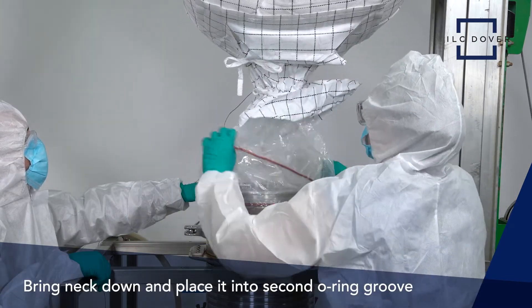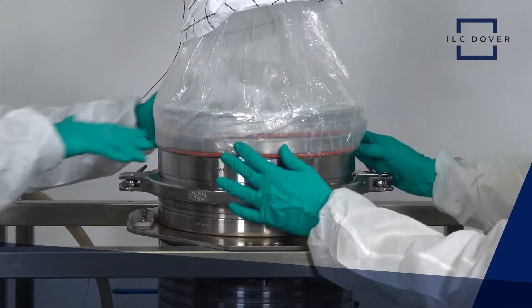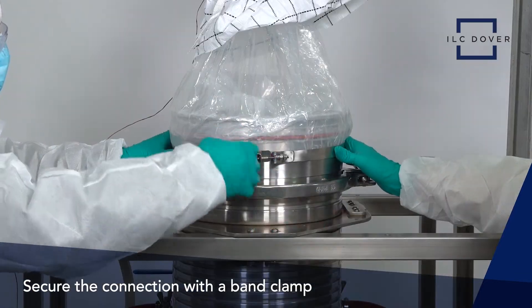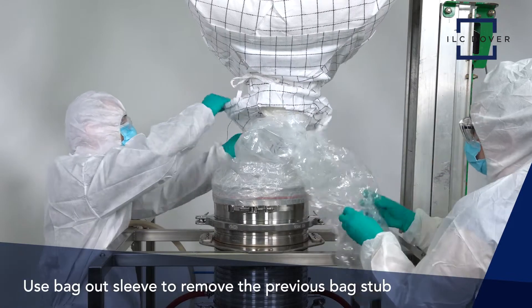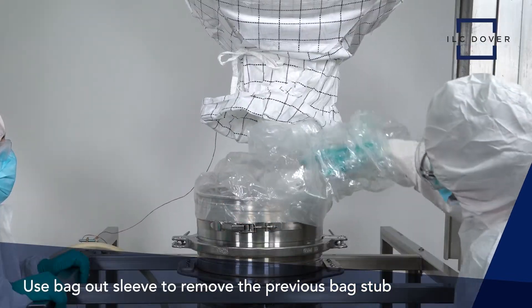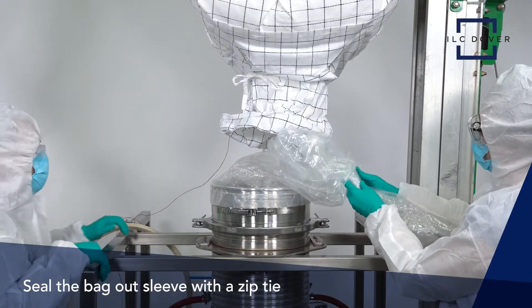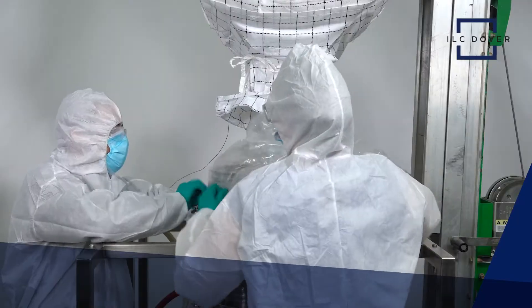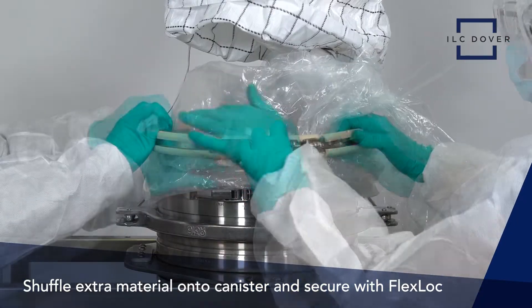First, bring the neck down and place it onto the second o-ring groove. Secure the connection with a band clamp. Next, locate the bag-out sleeve and use it to remove the stub of the previous bag. Once complete, seal off the bag-out sleeve with a zip tie. Shuffle the extra material down onto the canister and secure the neck in place with the flex lock.